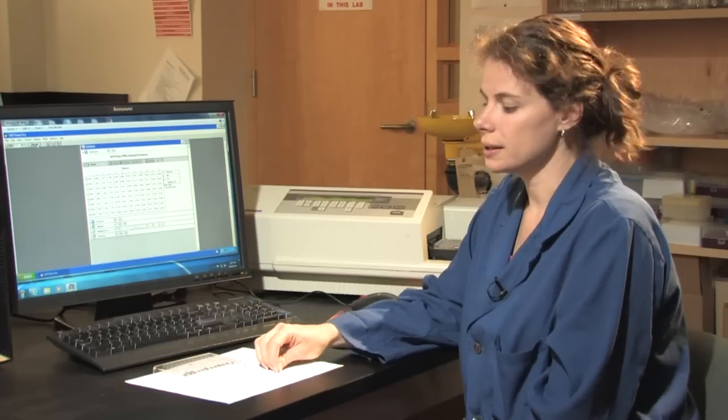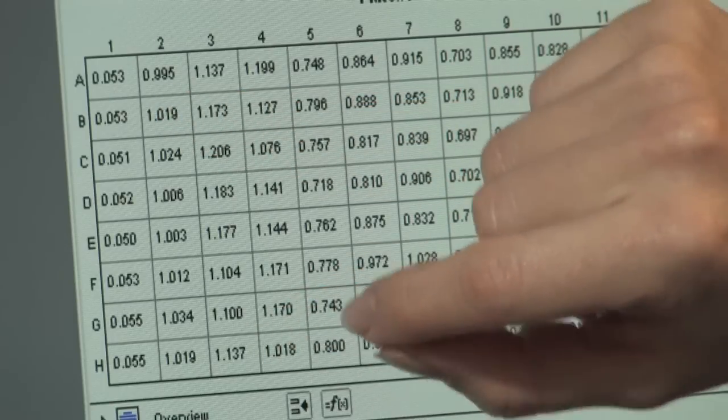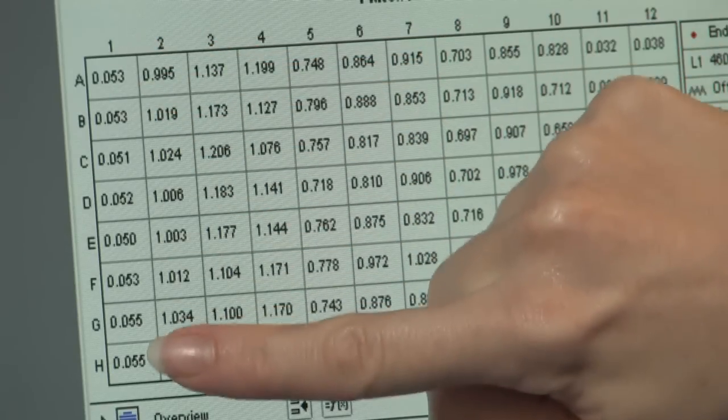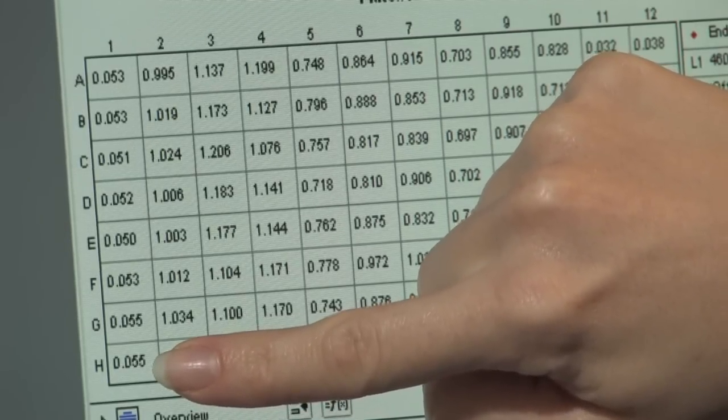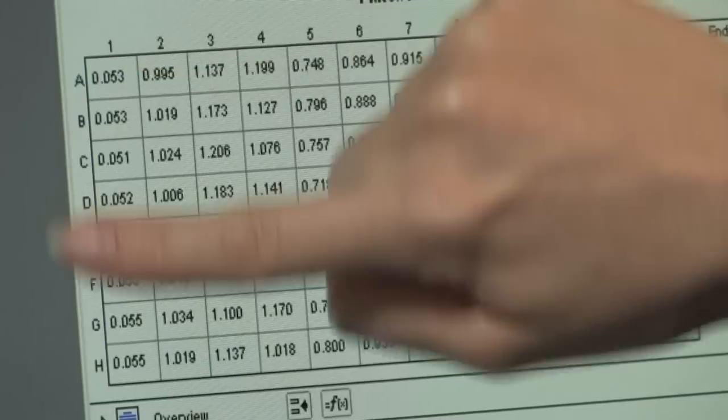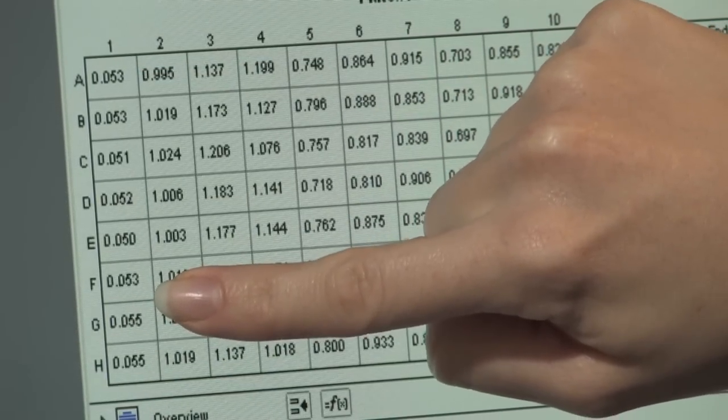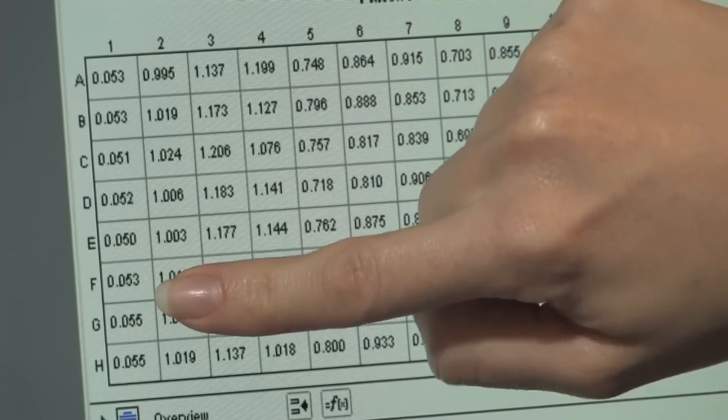So what the plate reader's done has used a light at a specific wavelength to read the color of each well. It's come back with a set of numbers representing the color change within the well. So for my first row, which represents the negative control or the DOPA with the soil buffer, my numbers are all at about .05. This means that there's very little color in those wells, which is what we expected because we didn't want the DOPA to change color.